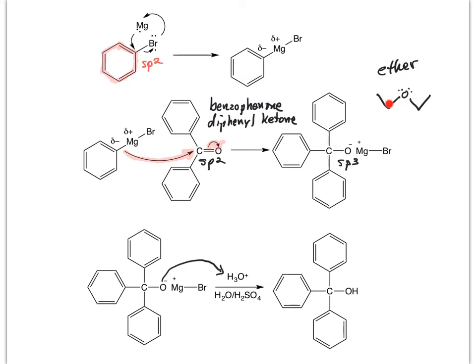But the ether is also aprotic, and we can get ether that is anhydrous. That is, it has been synthesized and all the water has been removed. So we will use anhydrous diethyl ether as our solvent for all of this.